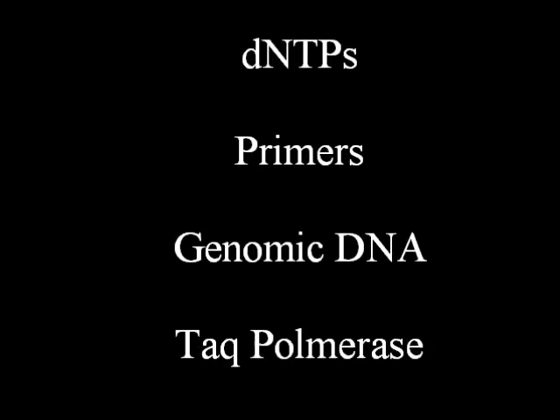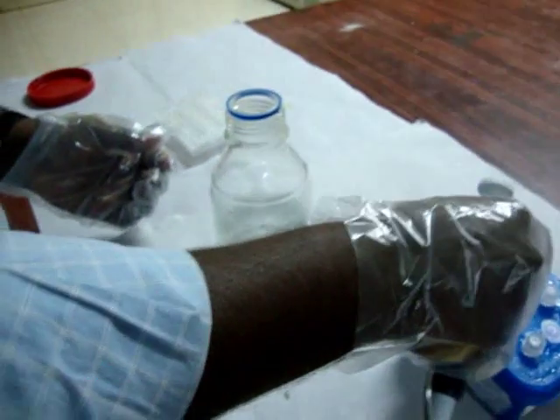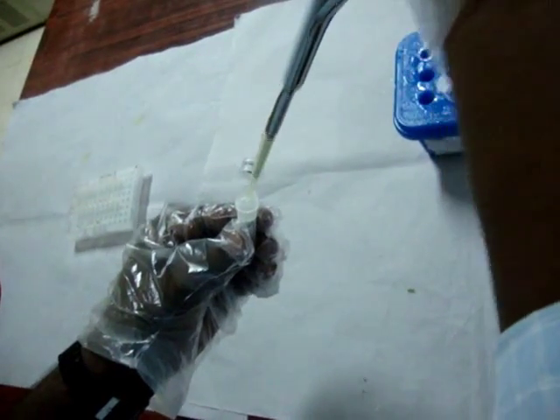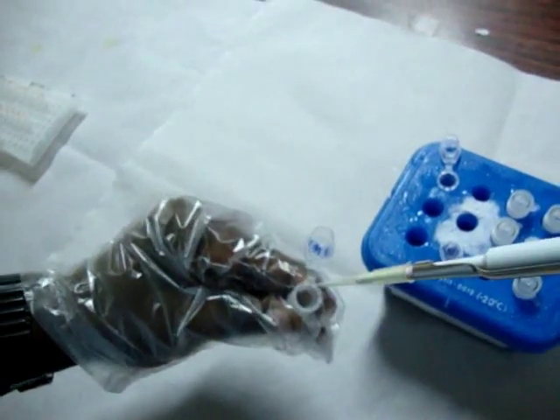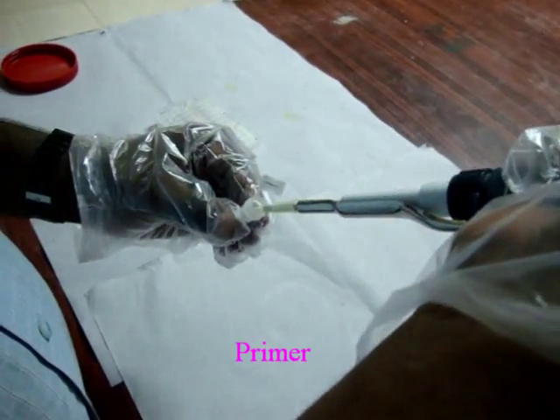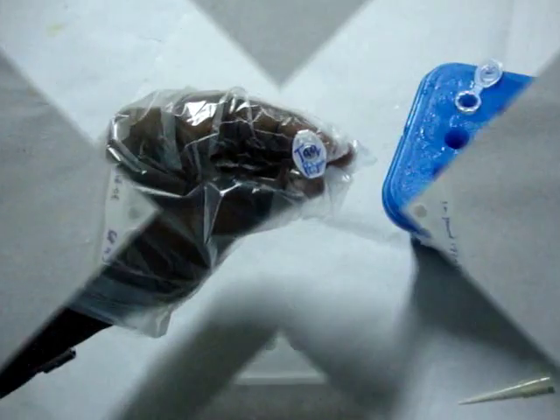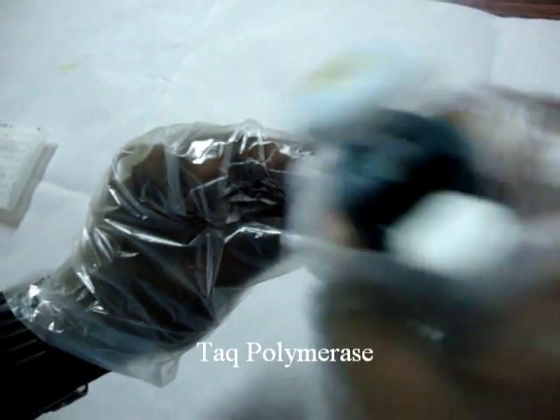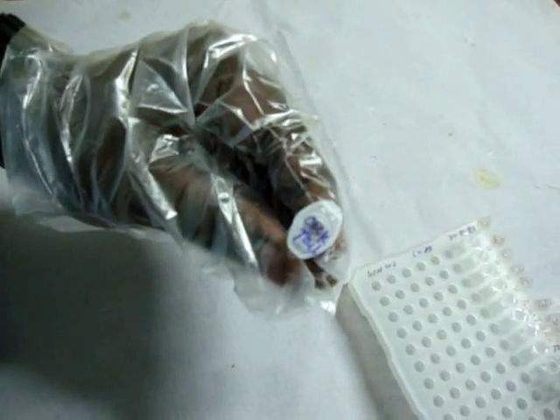The PCR reaction mixture contains sterile water, 10X PCR buffer to maintain the pH of the reaction, dNTPs to provide purines and pyrimidines, primer to bind the complementary sequences, genomic DNA, and Taq polymerase.